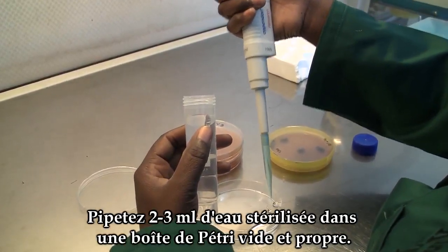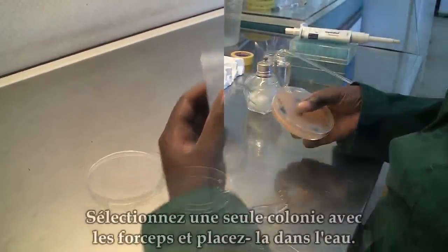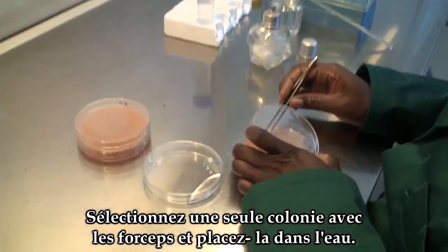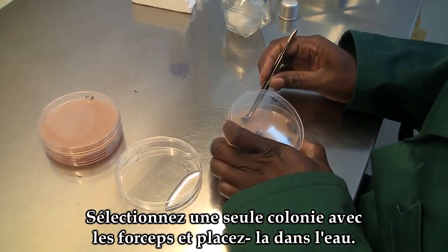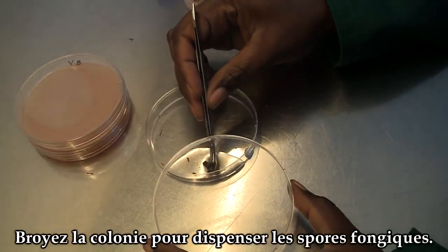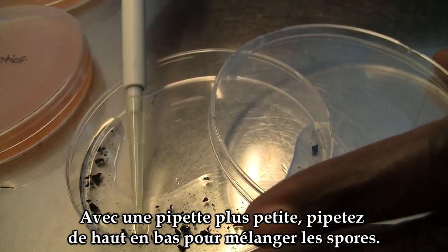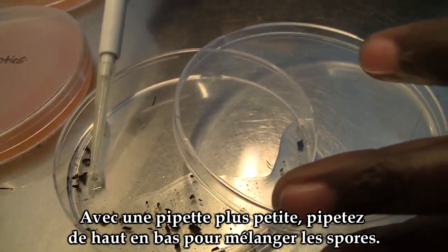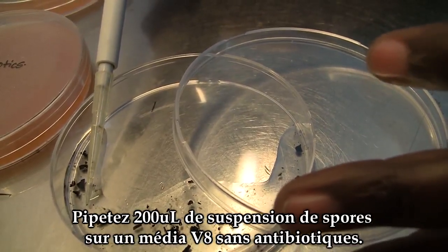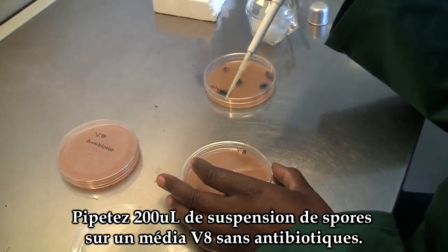Prepare two to three millilitres of sterile water into an empty and clean petri dish. Pick a single colony using forceps, place it in the water, and crush the colony to release the spores. Using a smaller pipette, pipette up and down to mix the spores, then pipette 200 microlitres of the spore suspension onto two V8 media plates without any antibiotics.